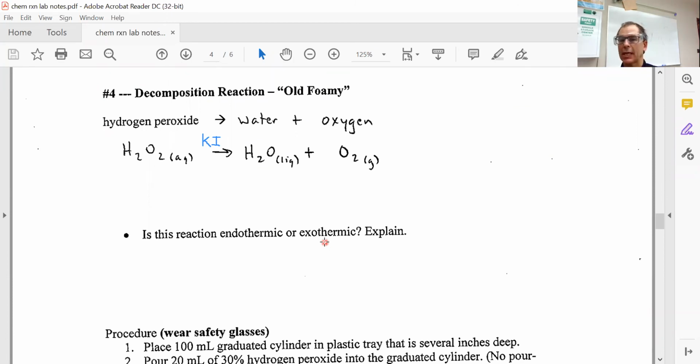They gave off heat. If the reaction gives off heat, the surroundings will feel warmer. I put my hand on the bottle or by those bubbles and it felt warmer. The reaction gave off energy to me, so it felt warmer to me.